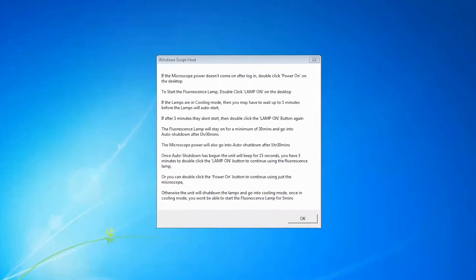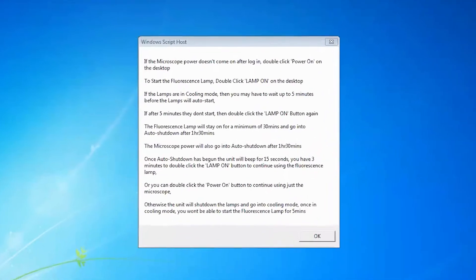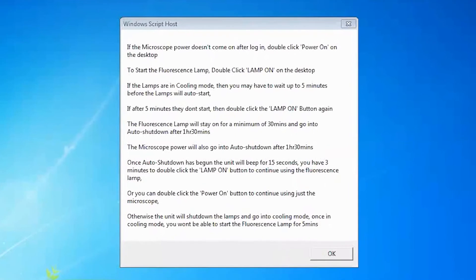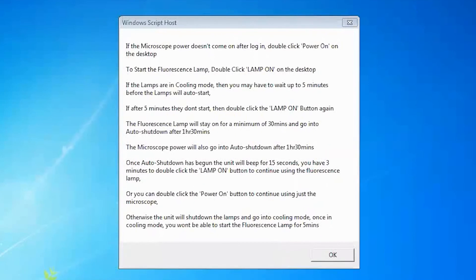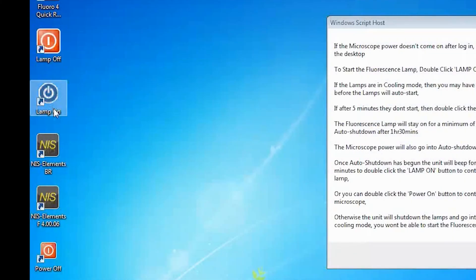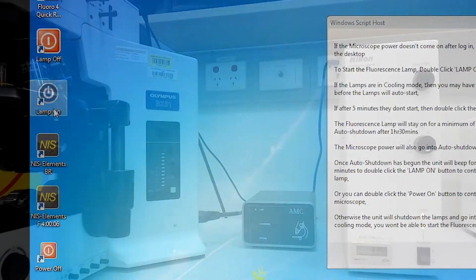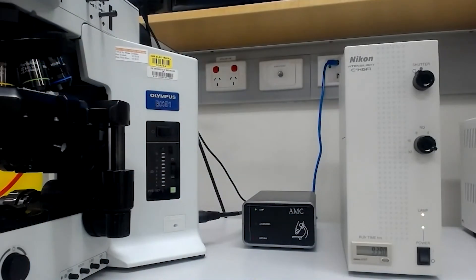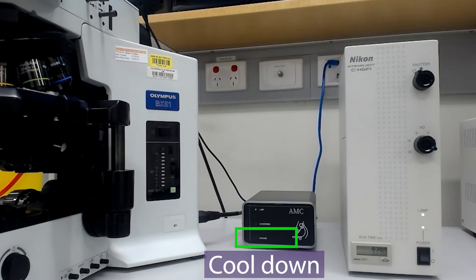The lamp on button turns on the lamp for a minimum of 30 minutes and a maximum of 90 minutes. You will then hear a constant beep that will warn you that the lamp is about to turn off. You have 5 minutes to double-click the lamp on button to continue using the microscope. If the lamp does turn off, you will not be able to start the lamp again for 5 minutes, as the lamp will be in cool-down mode.